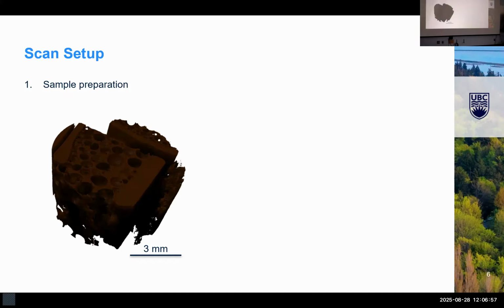They were having some strange problems in their chocolate, and just as a proof of concept, we put an Aero bar in there to see if it could stay inside of the warm machine without melting. And in fact, it did. And fortunately, it doesn't show up too well, but we got a cool looking image of an Aero bar.